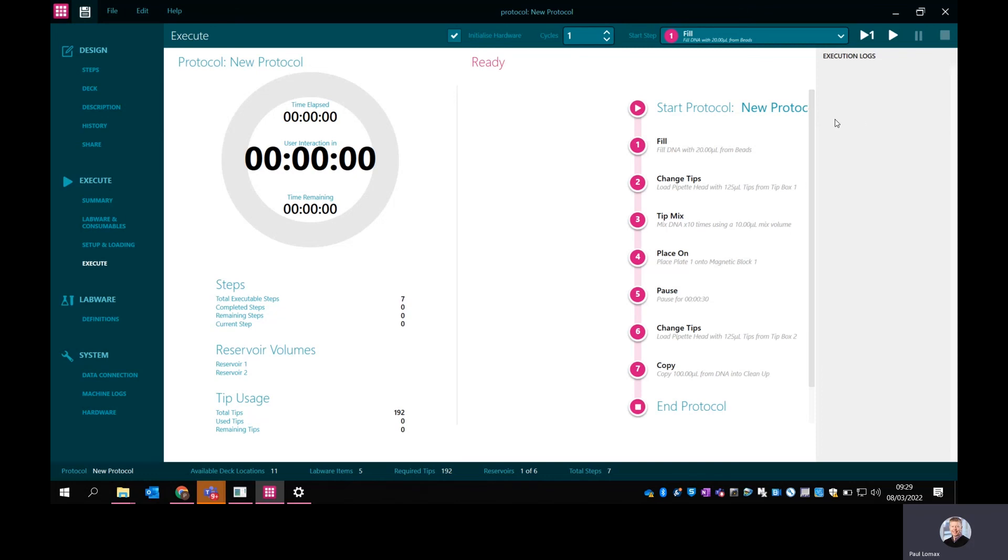If there is an issue somewhere in the protocol, you'll see exactly when that issue occurred. Then that can help you actually go back in and work out what's gone on and rectify the problem. That's a very brief summary.